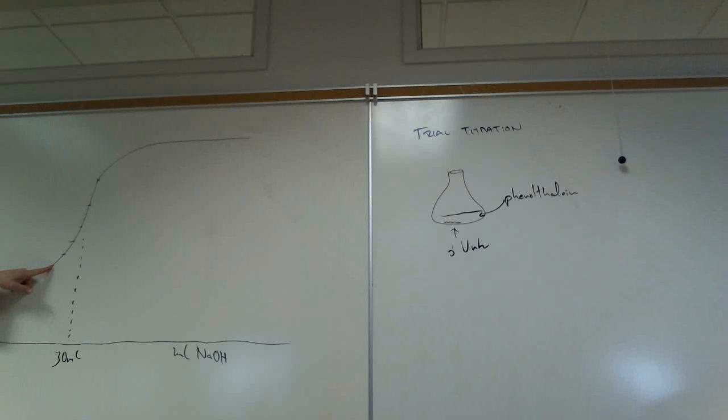Very little, 1/11. And so for some reason people say, oh, my pH has only climbed by 1, but then they think they're safe. And then boom, they missed it. They missed it because they're at the 10/11ths equivalence point. They only have 1/11 left, which is nothing. And so if you see that, you better start to slow down, drop by drop, if you aren't already.